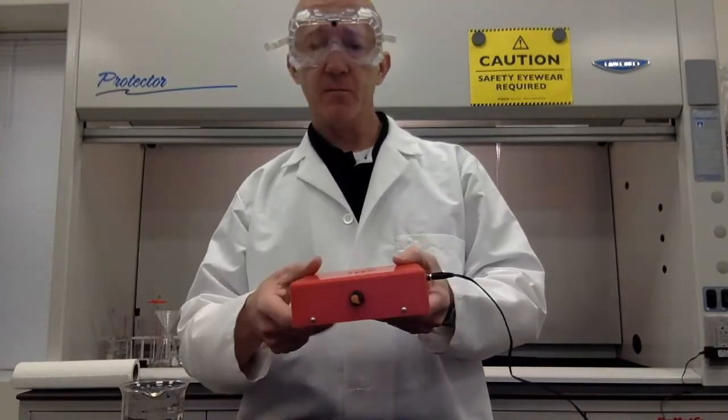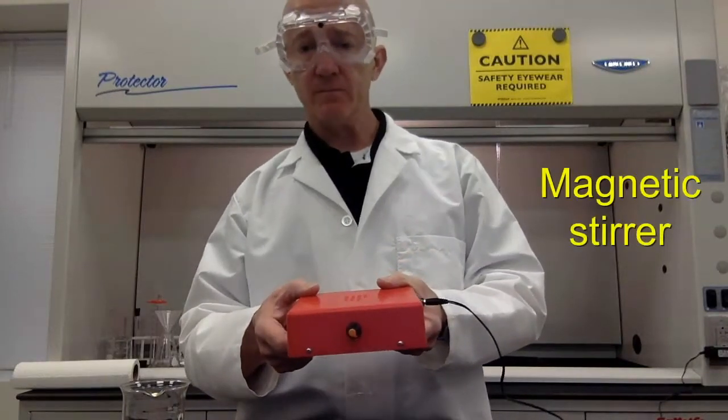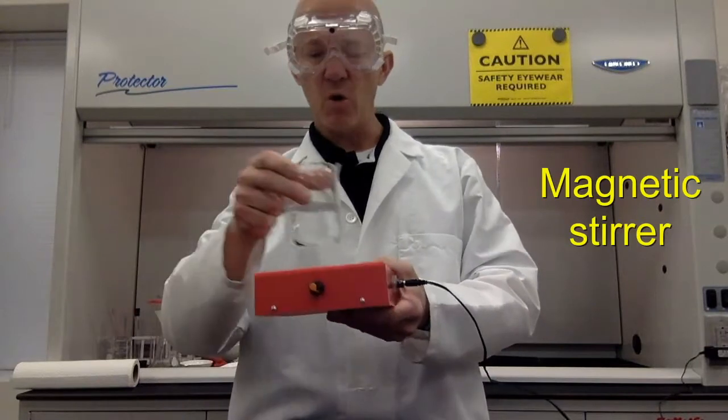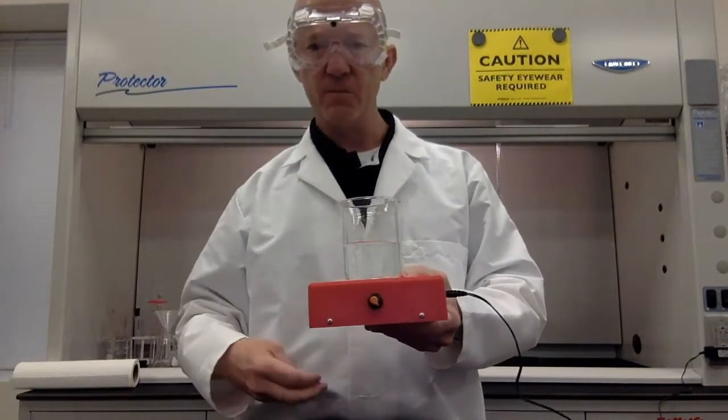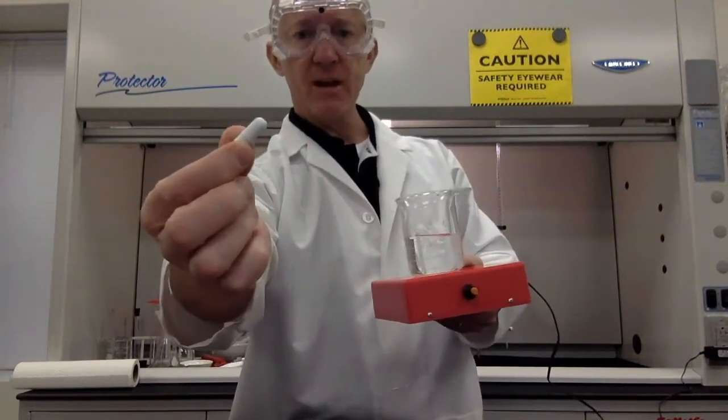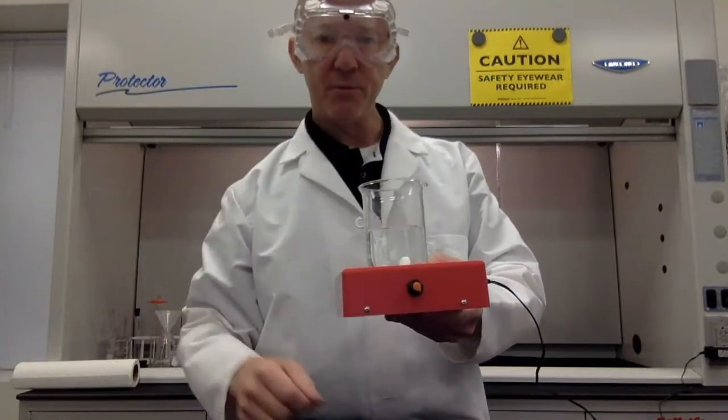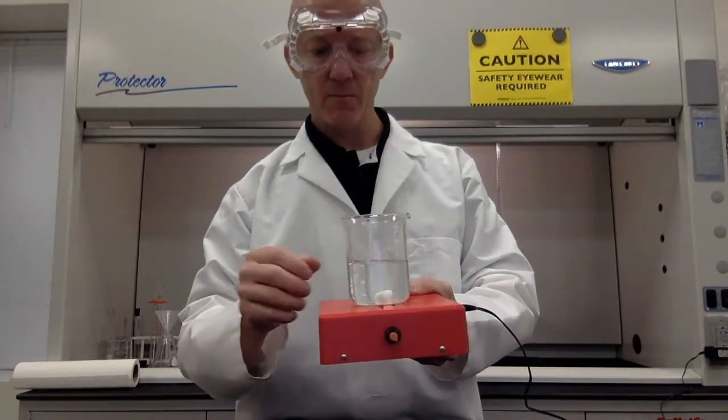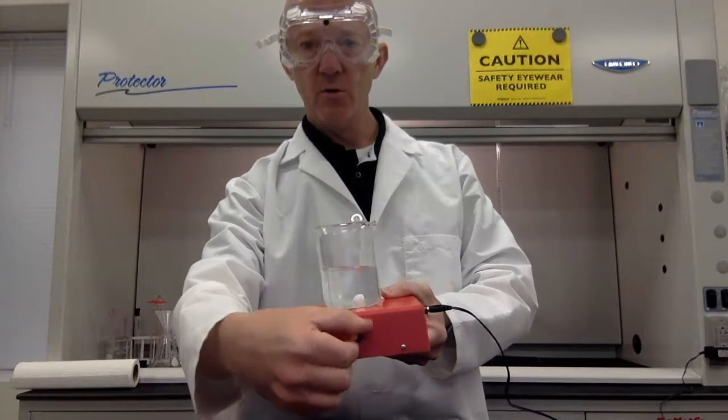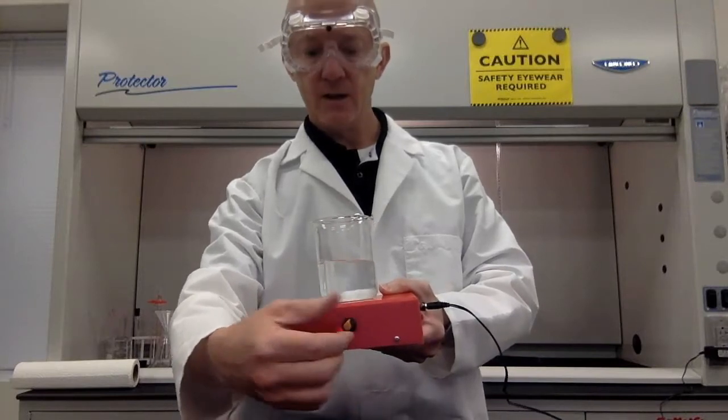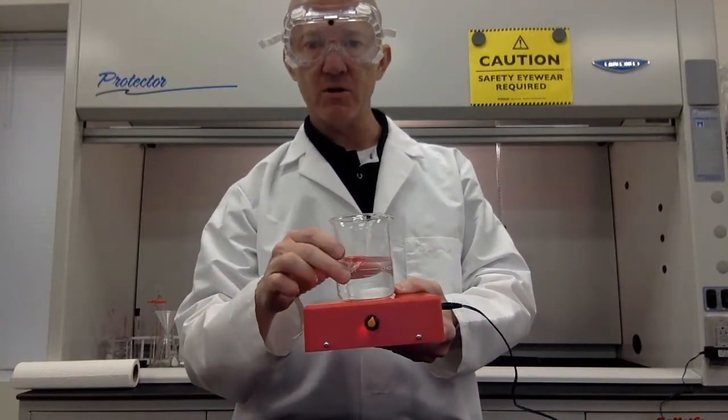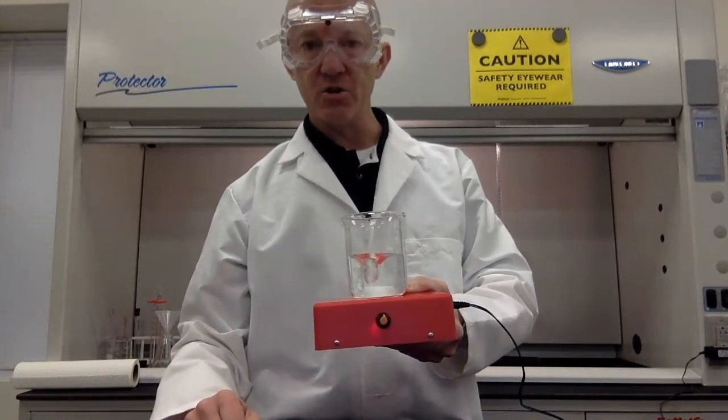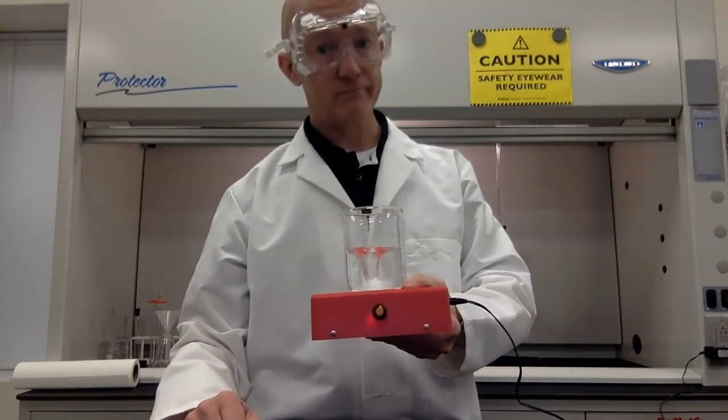This is something I think is pretty cool. It's called a magnetic stirrer. If you have a solution and you don't want to be constantly stirring that solution. You can use this little magnetic bar and place it in the solution like so. Then when you turn on the magnetic stirrer it causes the bar to rotate and it stirs your solution for you. Not bad.